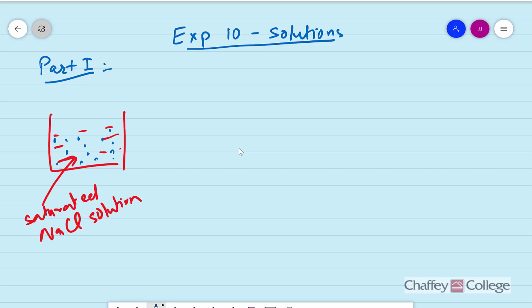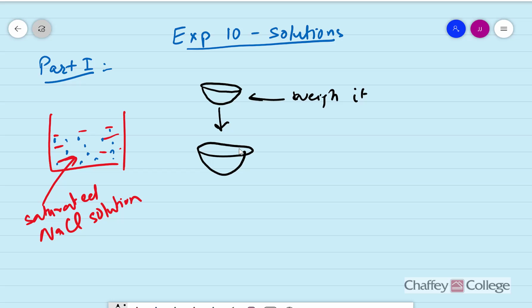What we are going to do in this experiment is that we will take an empty container and we will weigh this empty container, and then we will add our sample solution into it, about 5 ml, and then we will weigh it again.